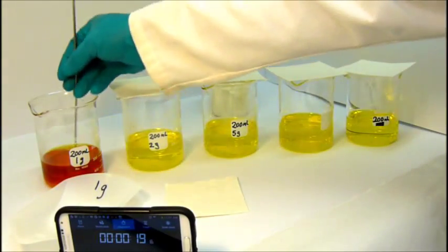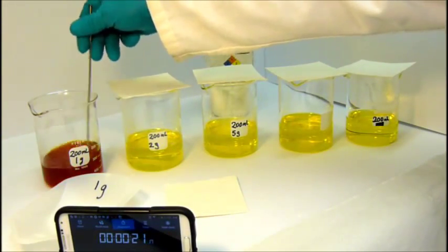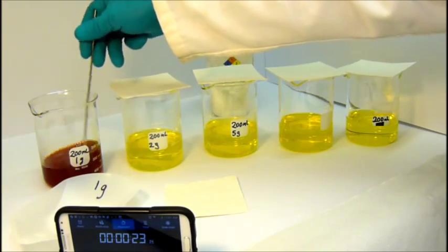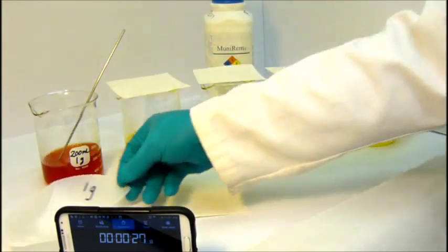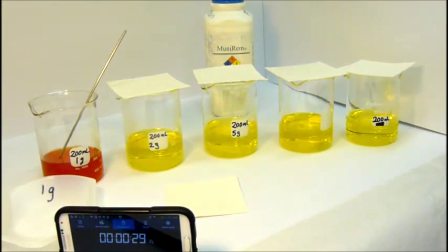We have a timer running to show that you are watching the process in real time. You will see that the picrate in the first beaker has been neutralized in approximately 25 seconds. The color then starts to lighten as Munarem affects some of the safe byproducts of the neutralization.